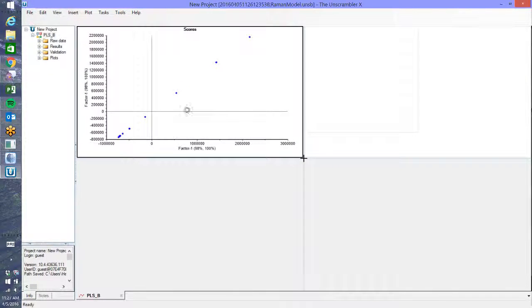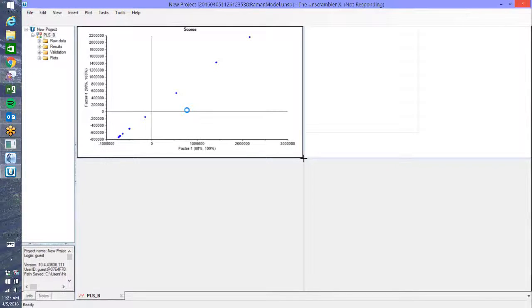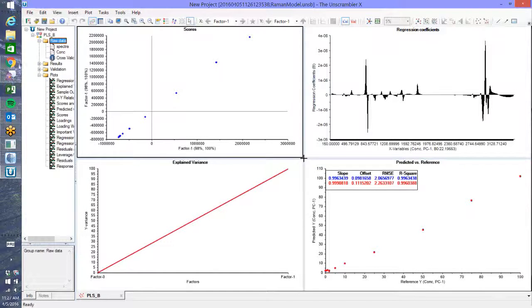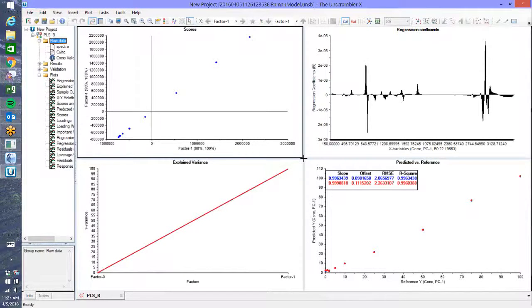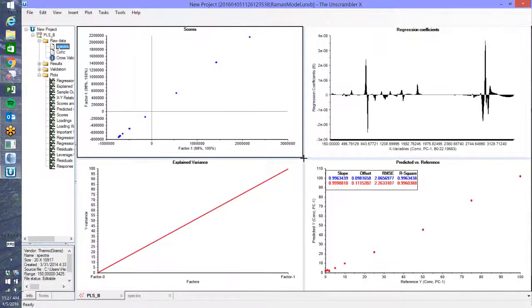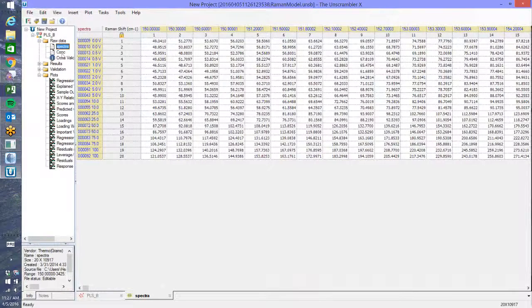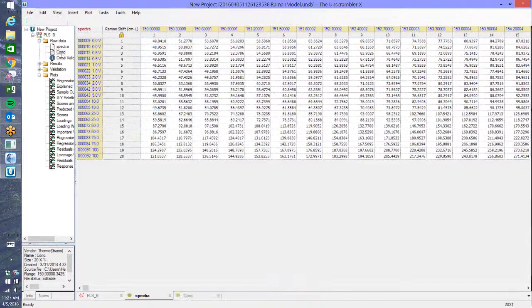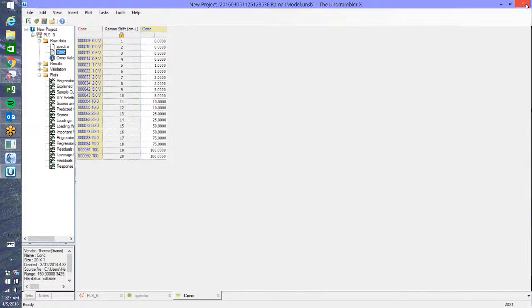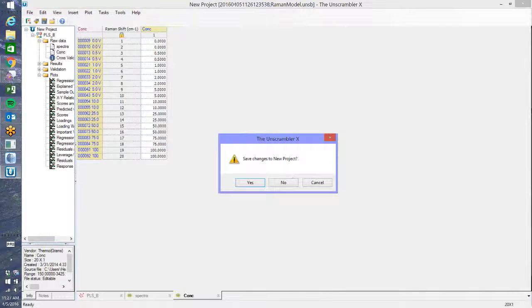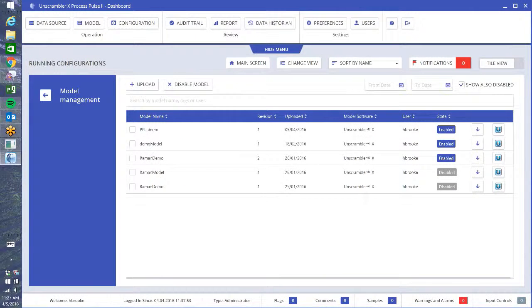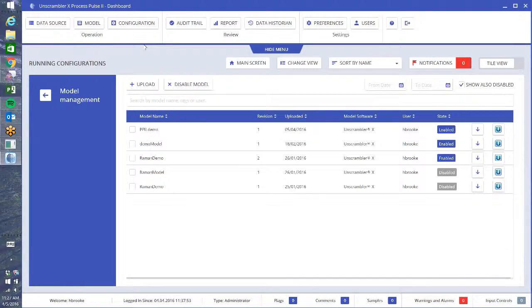So this is your model and you get all the graphics that you generally expect from the Unscrambler. You also have the raw data, so you can look at your original spectra in that sheet, concentrations, etc. So I'm just going to close that. No, I don't want to save any changes. And so the third step now is configuration.